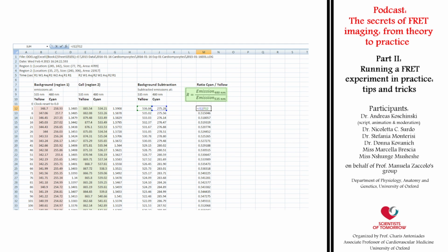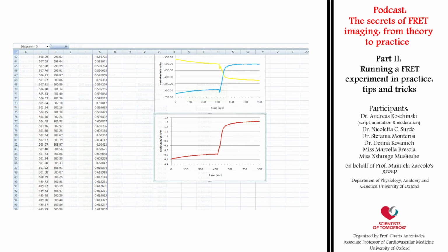Now we will create the ratio just by dividing the value of the cyan by the value of the yellow emission. This inverts the data and leads to increasing ratio values at increasing cAMP concentrations, which can be seen in the corresponding graph. Finally, we will create the FRET change graph.